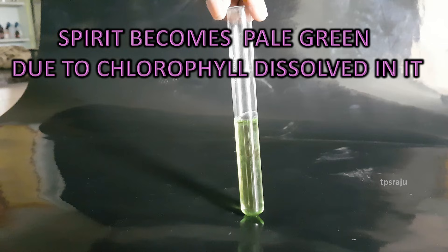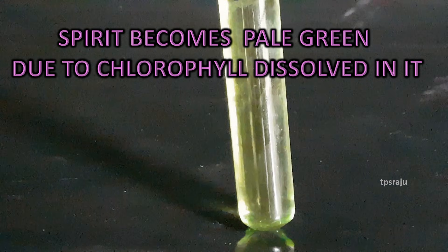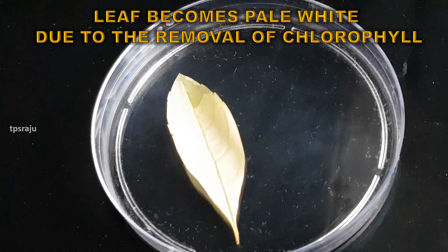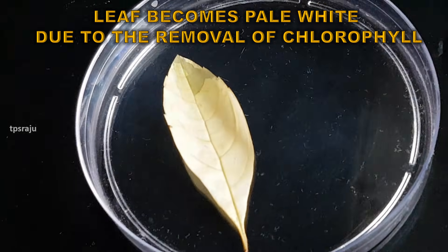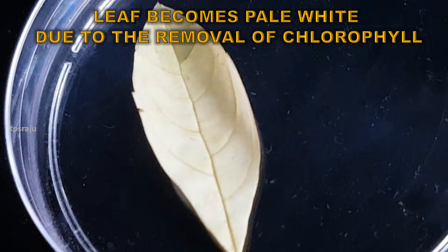Observe here. The spirit becomes pale green due to chlorophyll dissolved in it from the leaf. The leaf becomes pale white due to the removal of chlorophyll from it.